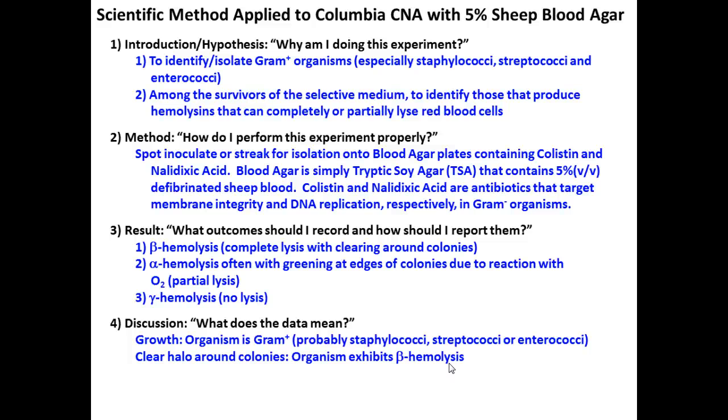Yeah, that's what I'm saying. They do 2 swabs. One, they're going to run the test. The other one, you don't see them put it on the blood agar. They stick it in a tube and they send it off to the lab, and they still do that test. They just do it in the lab now. Because even if the rapid one comes out positive, it's going to be confirmation. It's always good to have confirmation.